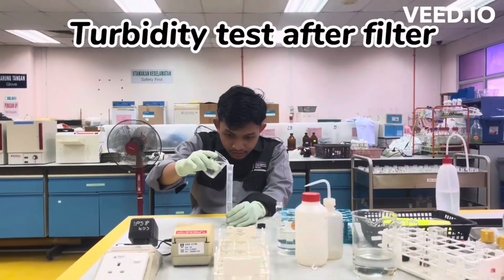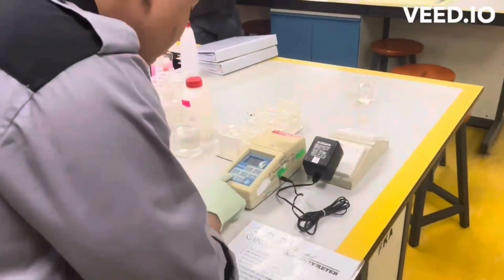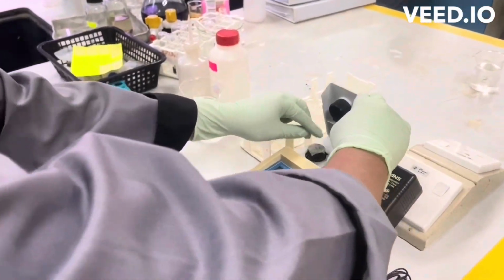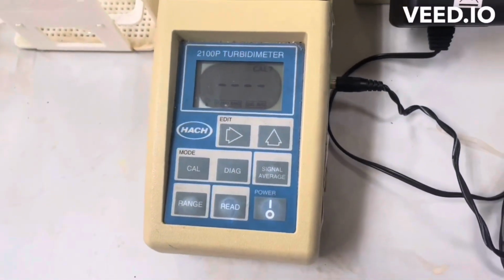Fill a sample cell to the line, which is about 15 milliliter. Wipe the sample cell. Set the turbidity meter to signal average and auto range. Insert the sample cell in the instrument cell compartment. Press read and get the turbidity. This is the value in NTU.